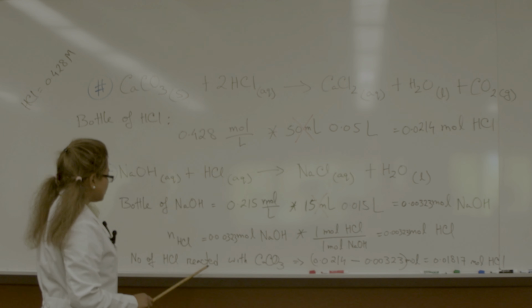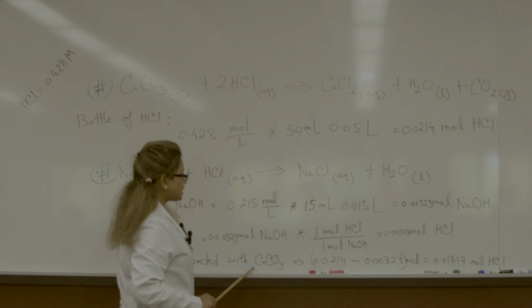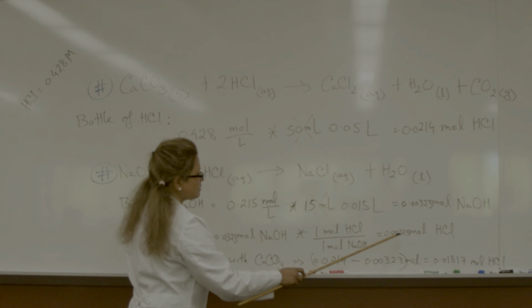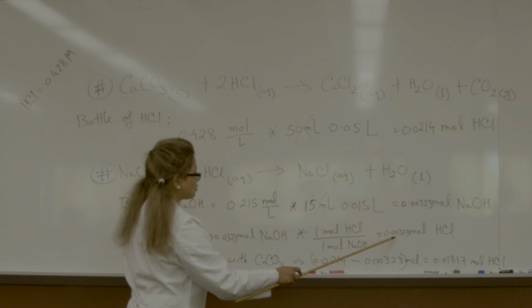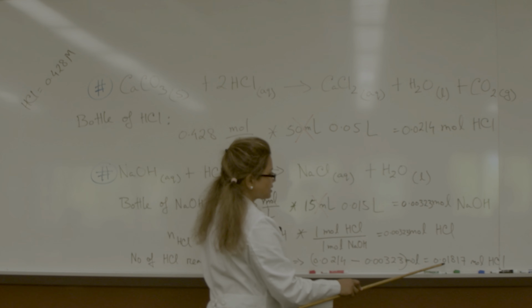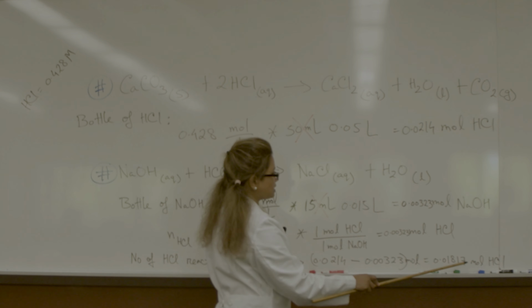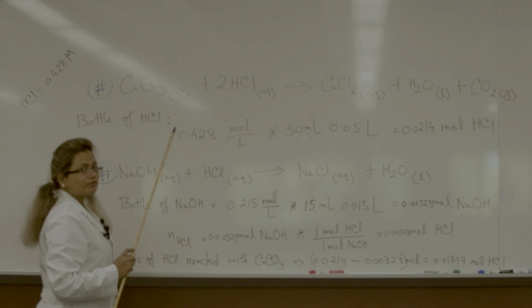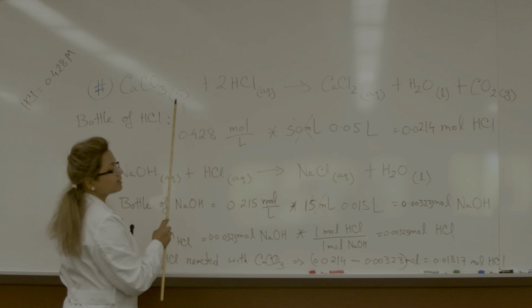So the number of moles of hydrochloric acid reacted with calcium carbonate is the total minus the moles used with sodium hydroxide, right?